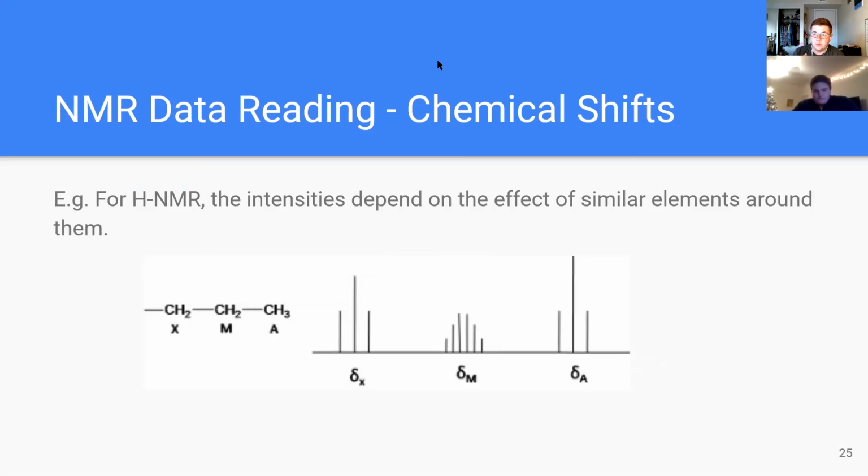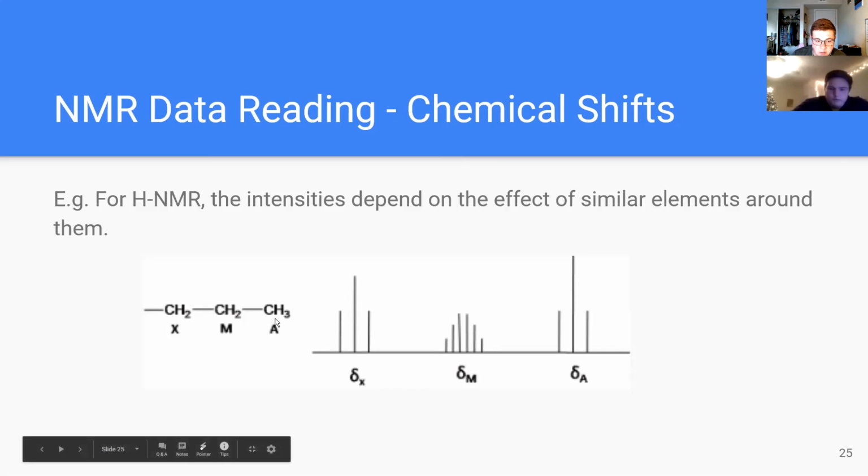And then for the actual polymers themselves, here you have a group of ethylene, polyethylene, where in this case, the lines are what you would actually see during an NMR reading. And they're based off of the N+1 rule. Like you may have remembered, hydrogen 1 isotope is the most popular reading for NMR. So we don't really care about the carbons in this scenario, but we care about what hydrogens they're connected to.